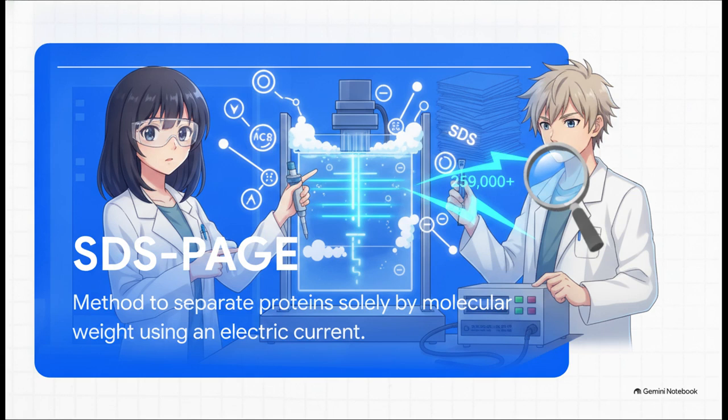By the way, the paper by Ulrich Laemmli describing this method is one of the most cited scientific papers in history, over 259,000 citations. Imagine stepping into a dimmed lab, pipettes at the ready. It's like watching a complete cinematic experiment unfold right in front of you, much like the incredible protein separation presentations by Dr. Chem.